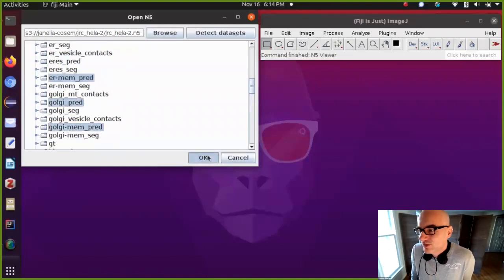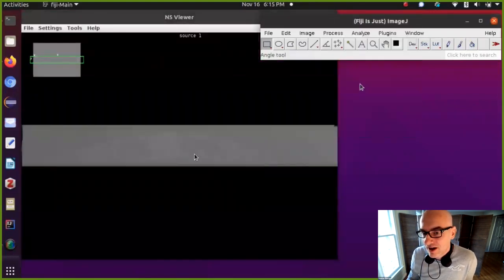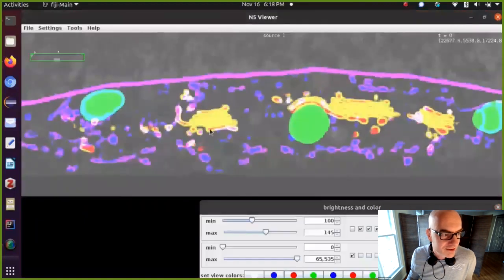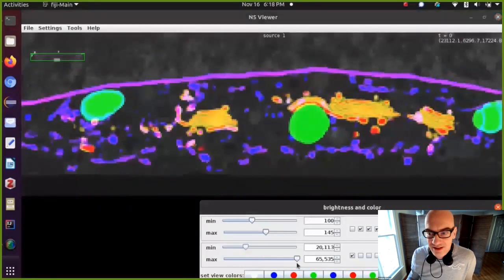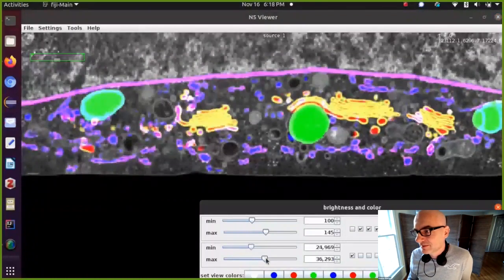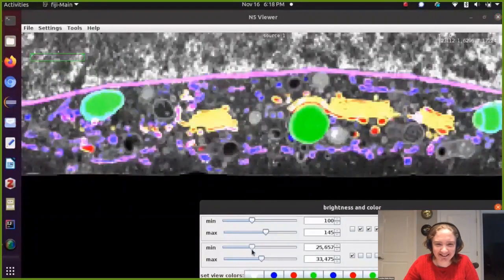If you want to open it in Fiji to do some ImageJ stuff, then you need to crop a small region. So here, for example, I'm opening things with the Big Data Viewer plugin. If I move the movie forward a bit, you can open several channels at the same time, and then you see the organelle predictions and so on. You can adjust colors and whatever. That's all multi-scale data sets, so they load quickly when I'm zooming in and out. Okay, I can do the same stuff. If I run into problems, I may shoot you an email.